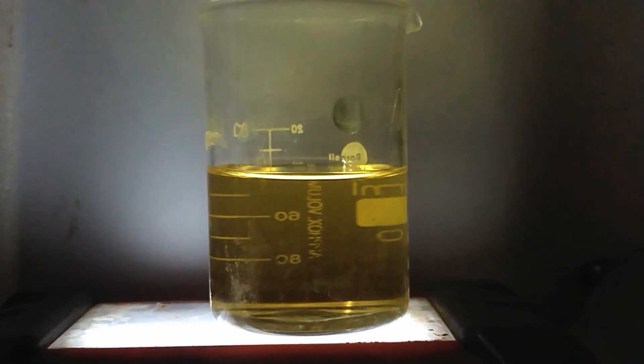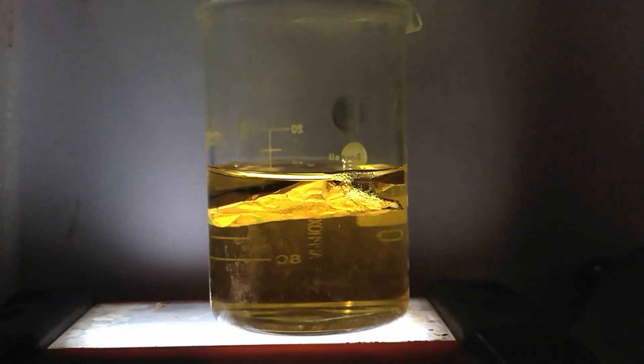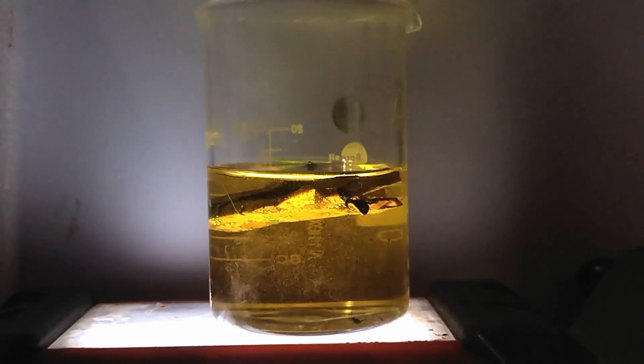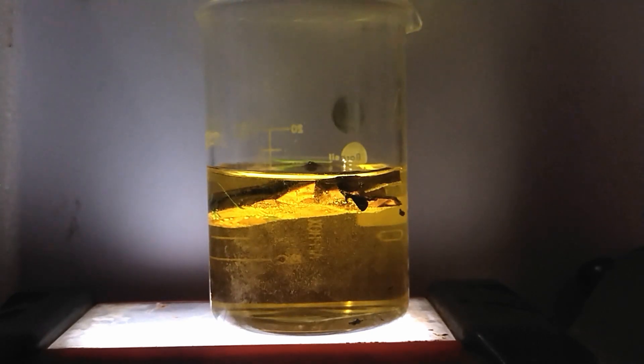Now let's see how it reacts with copper. The moment it touches the solution, the reaction begins instantly. Look at those bubbles — this is a sign of an intense chemical reaction.